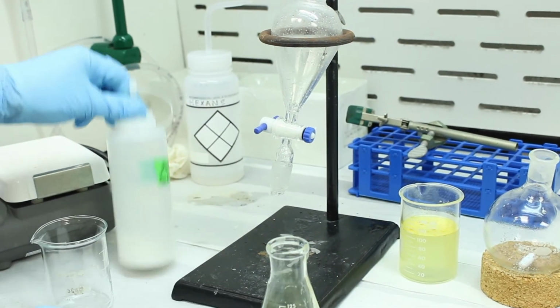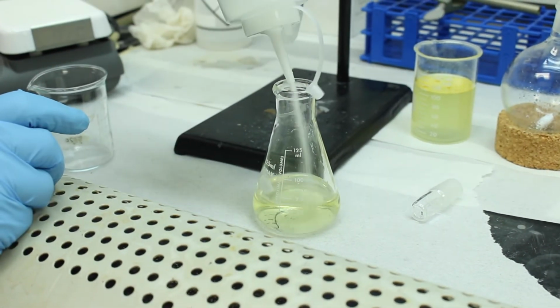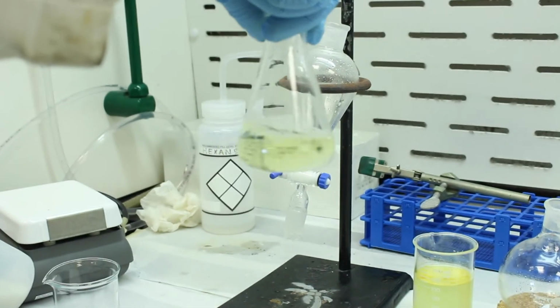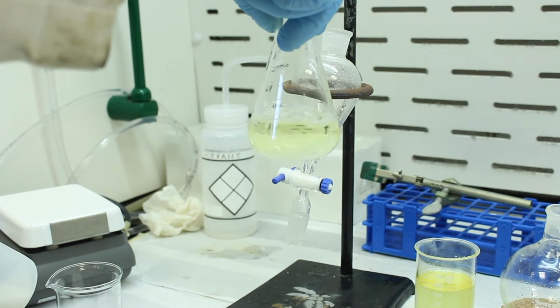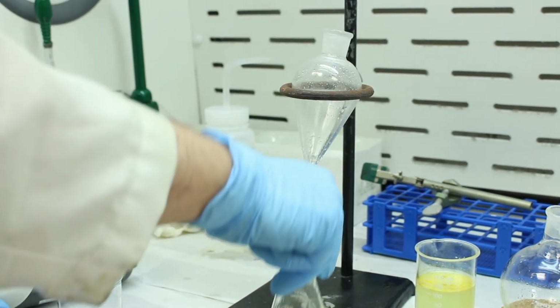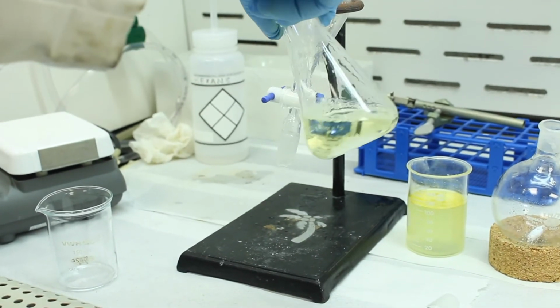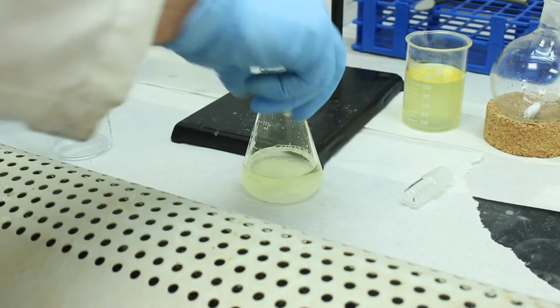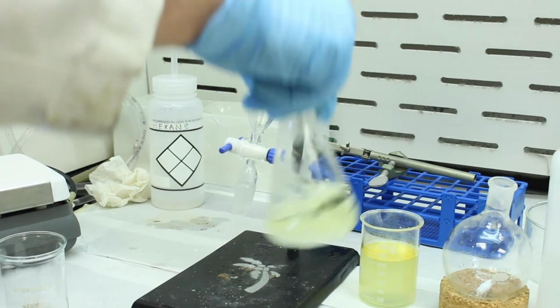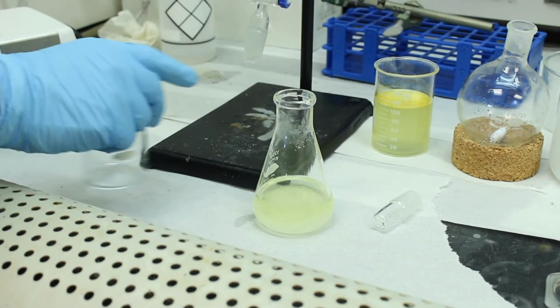Okay, so here's our ether layer. We're going to add the sodium sulfate to absorb excess water. Yeah, so you can see the sodium sulfate is clumping to large aggregates, so we'll add a little bit more. Yep, so that looks about dry enough there. So we'll let this sit for a few minutes, and then we'll put it into this beaker and get rid of the ether.